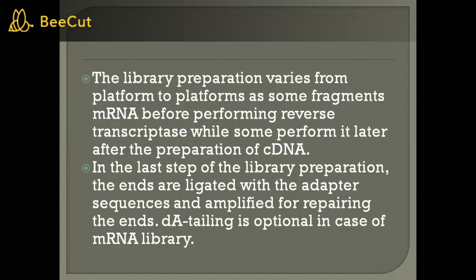In the last step of the library preparation, the ends are ligated with adapter sequences and amplified, and the ends are repaired. So for the library preparation, whatever the ends of those cDNA fragments are, we have to ligate them with the adapter sequence. And by using those adapter sequences, we have to amplify those cDNA fragments. For this, we can also do a repairing step. A-tailing is optional in the case of an mRNA library.